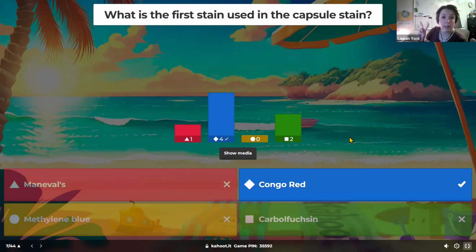What was the second one? Acid fast stain. I'm going to make little notes down here as I go through this just really quick, because this will help me keep my thoughts in order, otherwise I'm going to start talking off on one thing and not remember to come back to it.